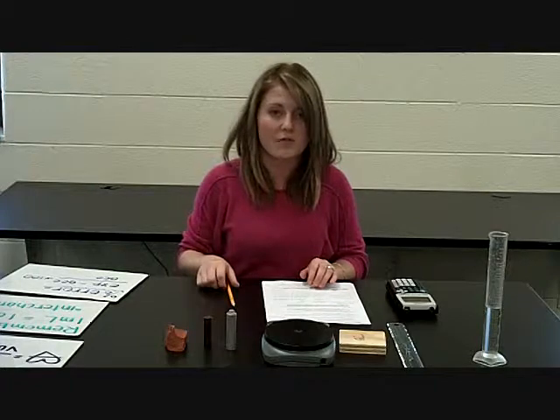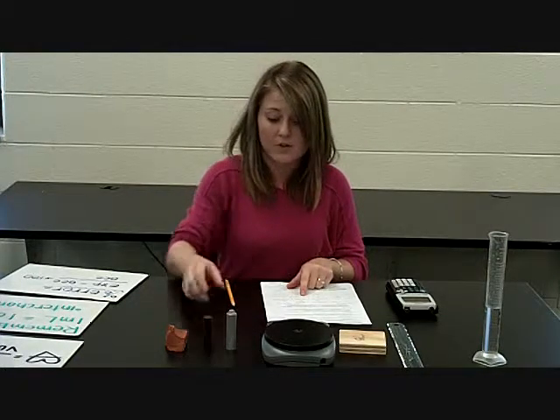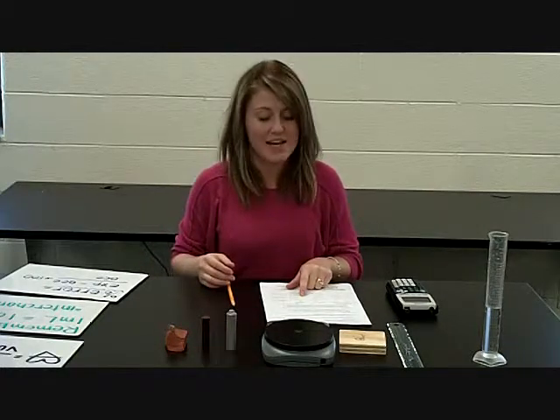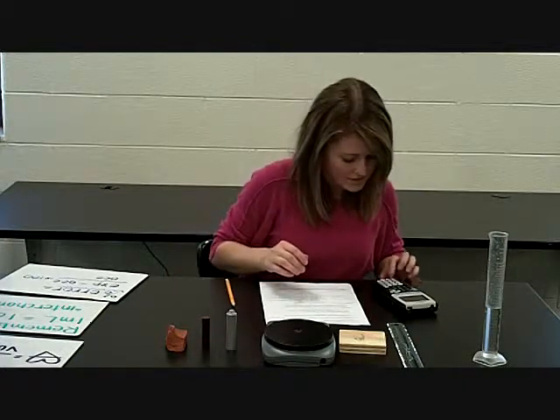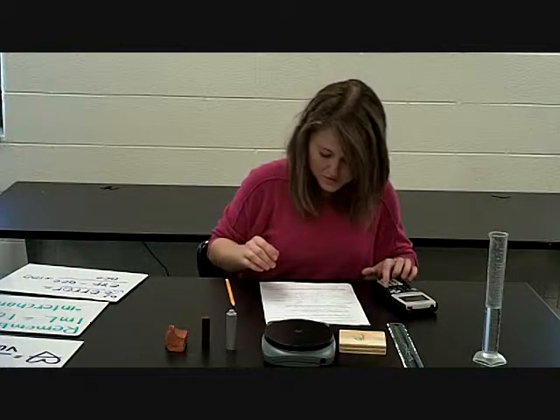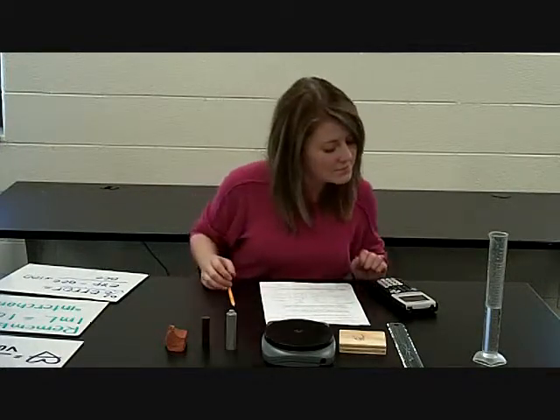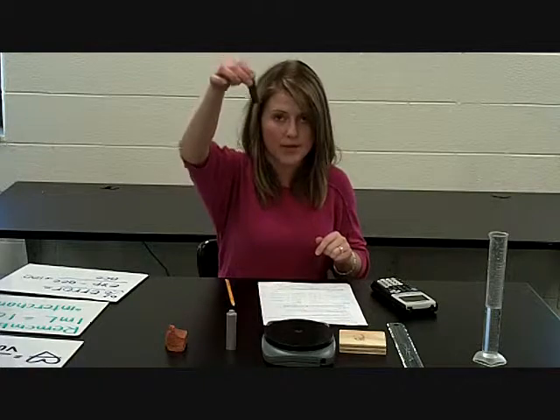Again, you take your mass of 14.1 grams, you divide by the volume, which we said was 10.7 milliliters, which is the same as 10.7 centimeters cubed. So you take your 14.1 and you divide it by your 10.7, 3 sig figs in each of those, right? You should get 1.32 grams per centimeter cubed as the density of your plastic rod.